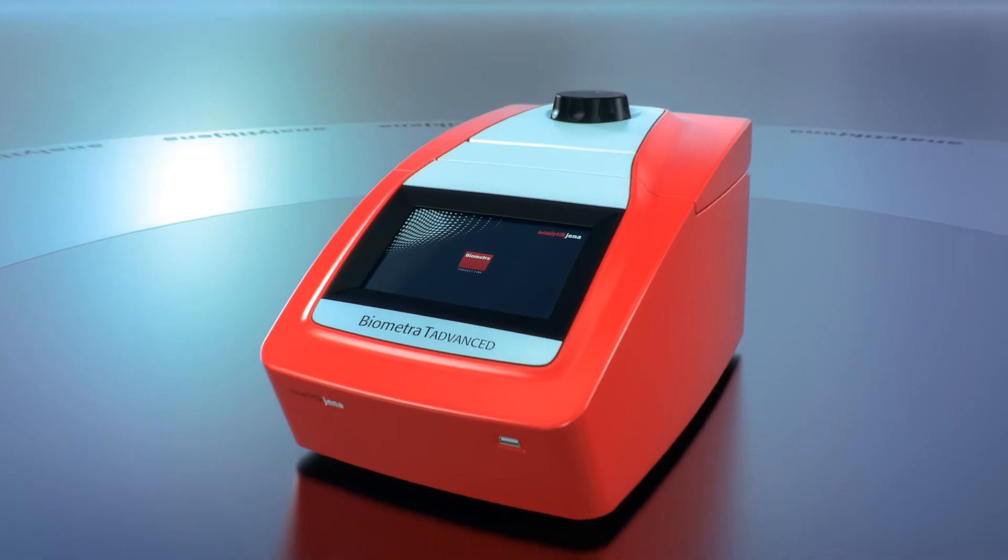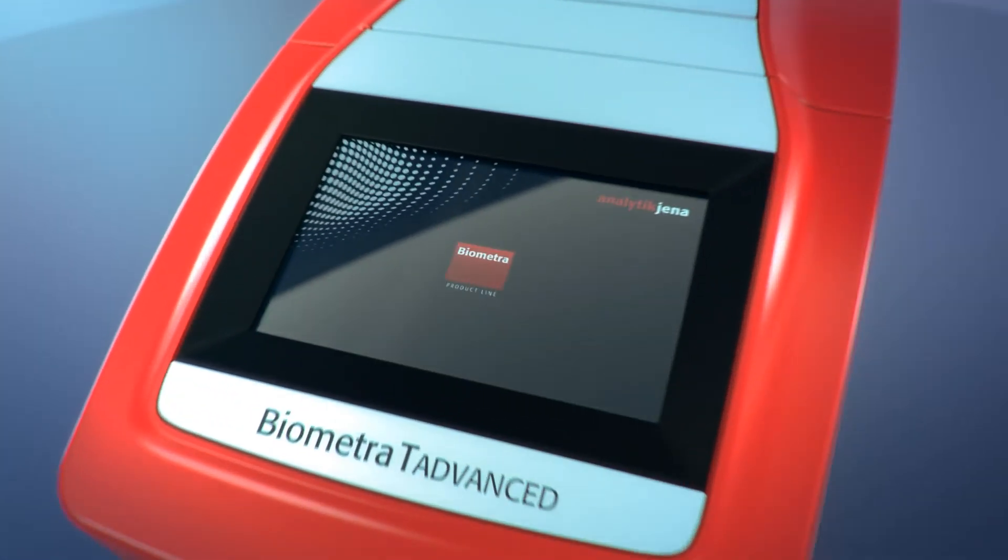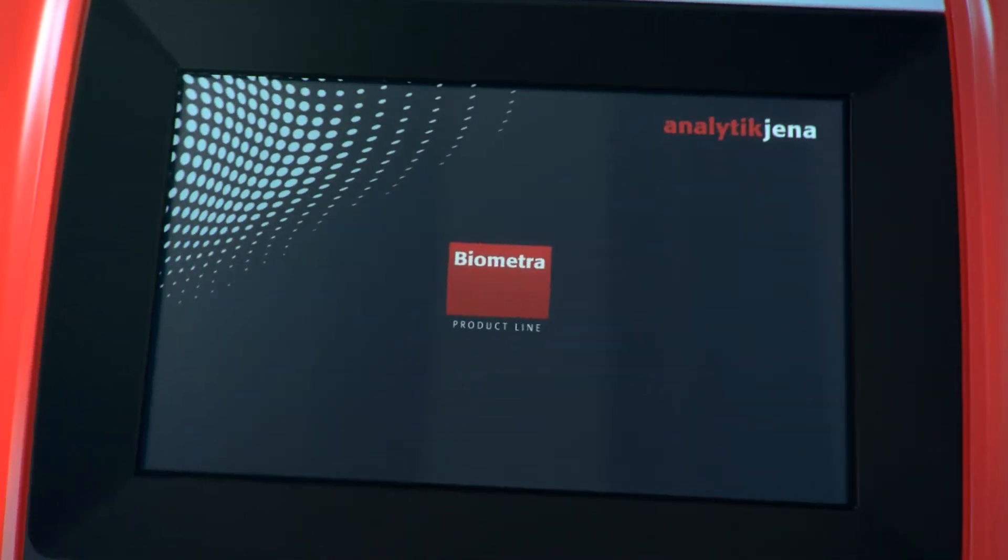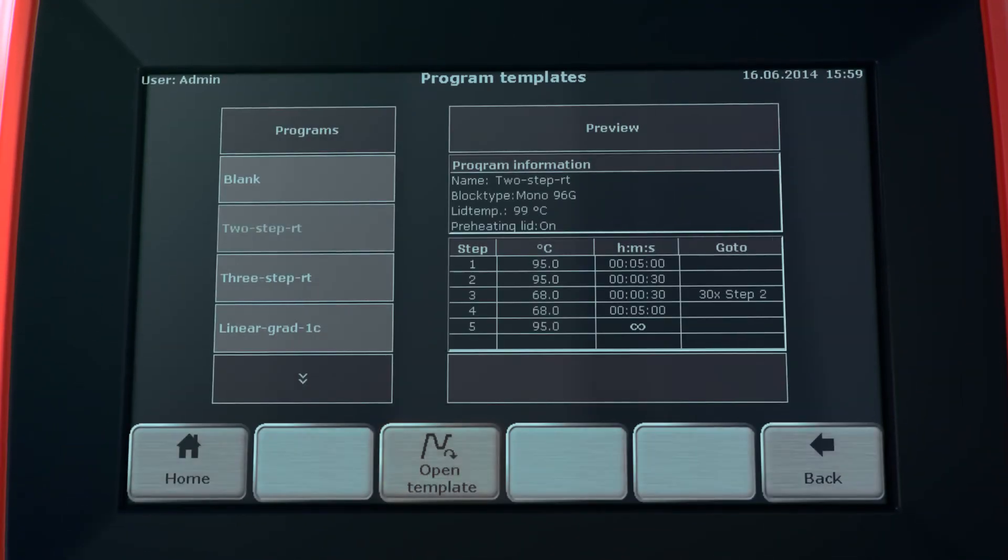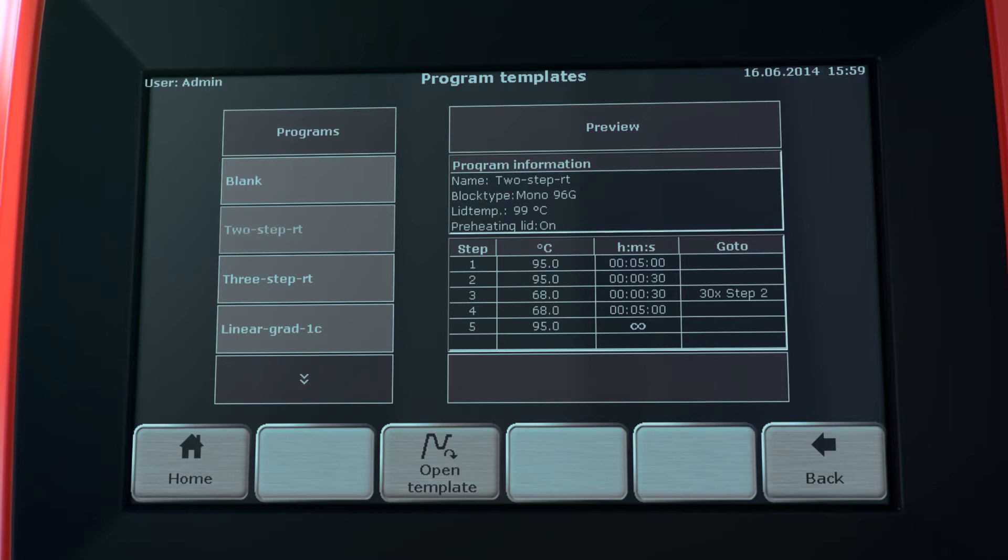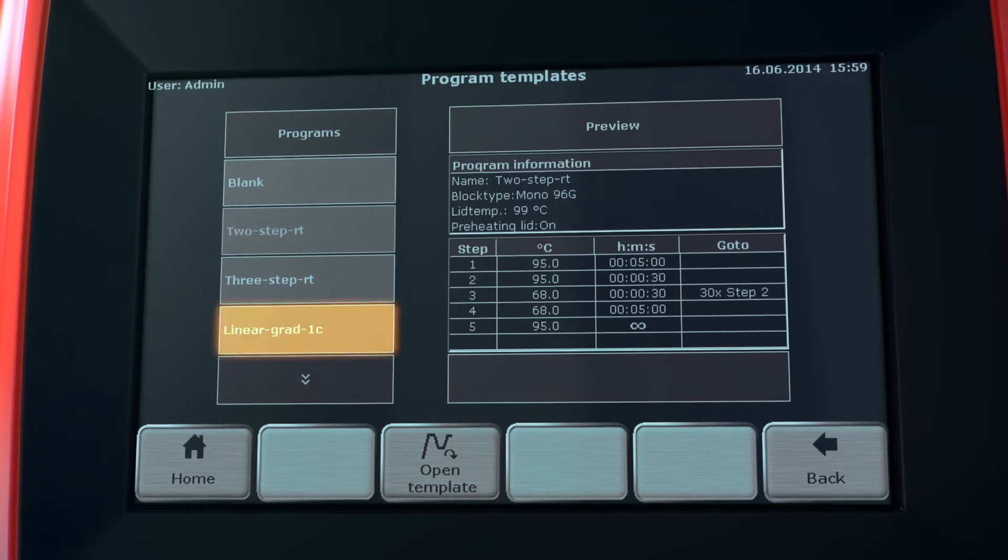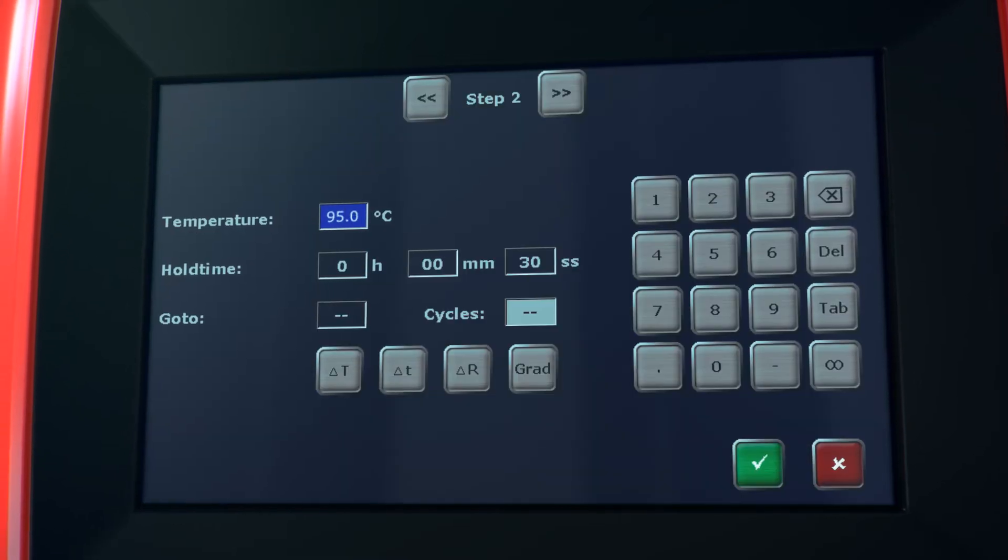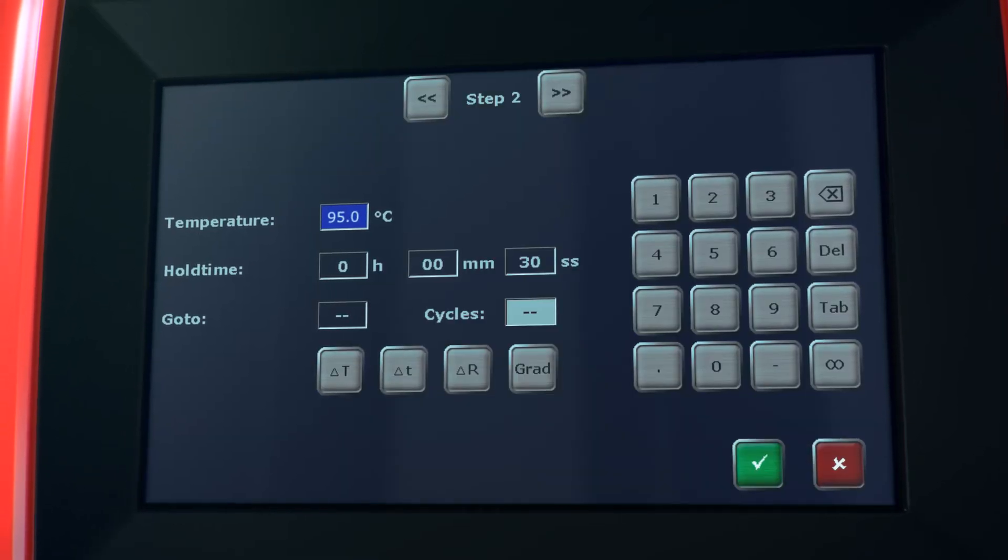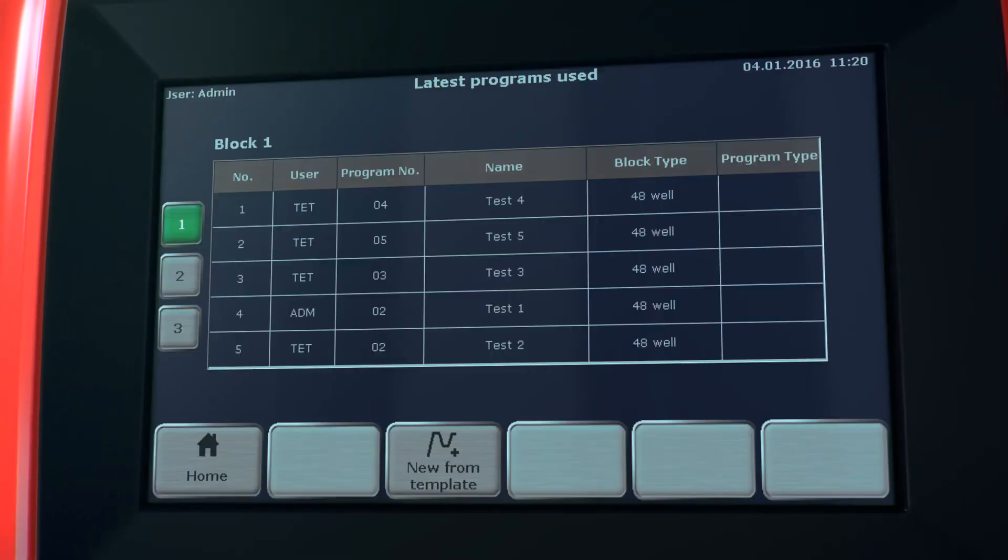Program templates can be used to create specific PCR programs. By integrated multi-step programming and linear gradient programming, the editing of program templates is very easy.